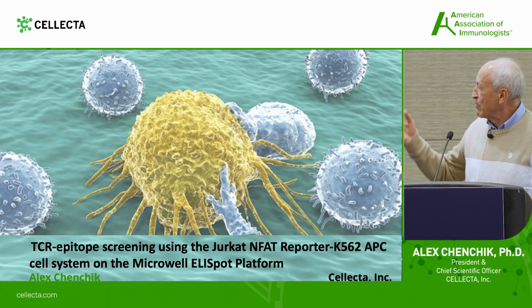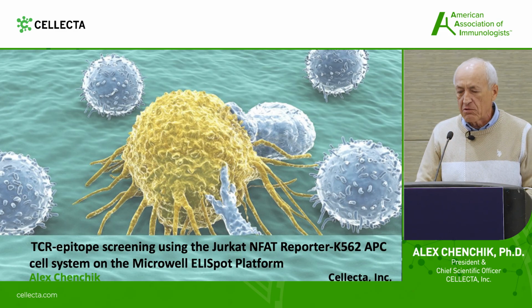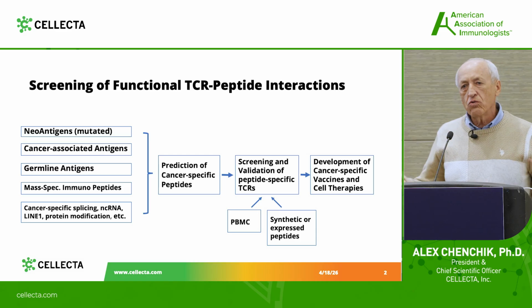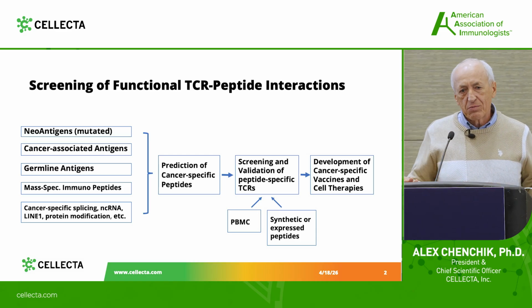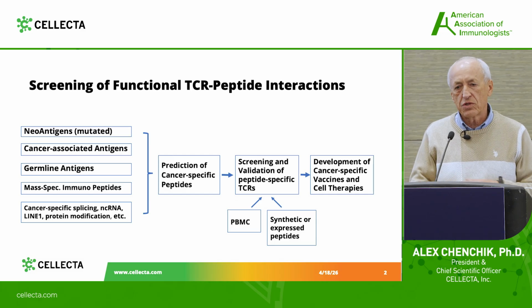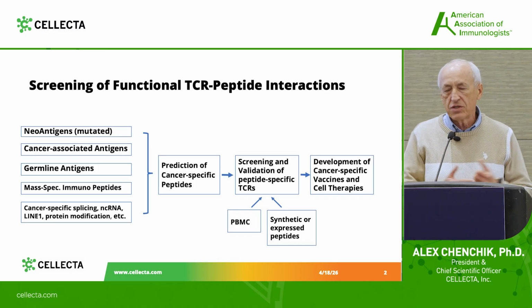So we're going to talk about Jurkat and a Microwell ELISpot system. The goal of this research is just to optimize the protocol and develop some reagents which allow researchers to do this screening of multiple peptides to identify and match T-cell receptors.